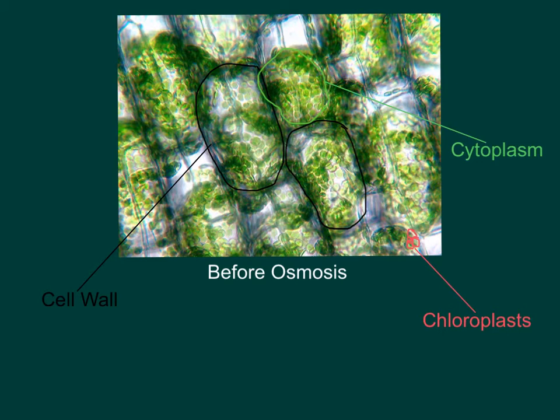As we can see here, we have a photo of multiple Elodia cells. Here, circled in black, are the cell walls. In the green circles, we can see cytoplasm, and in the red circles, there are chloroplasts.